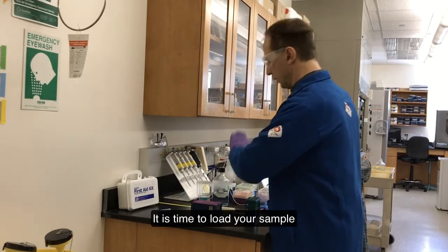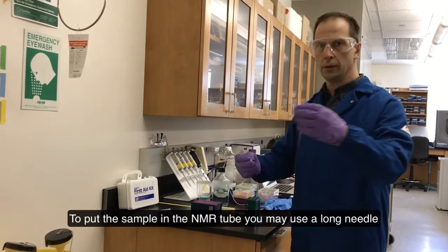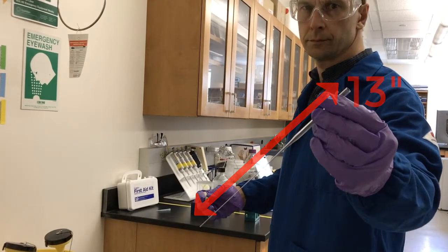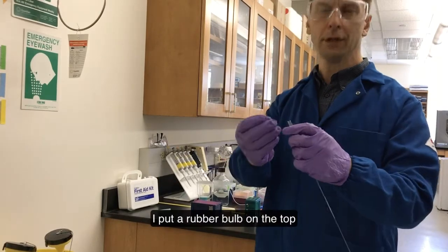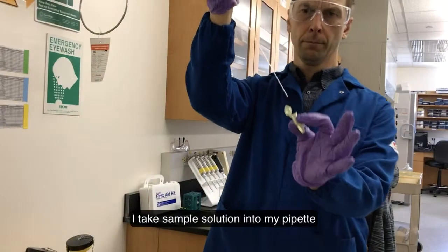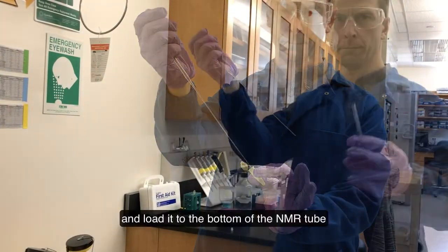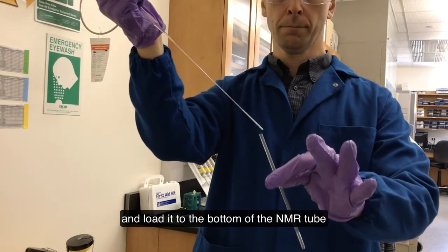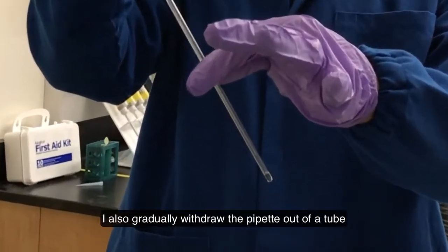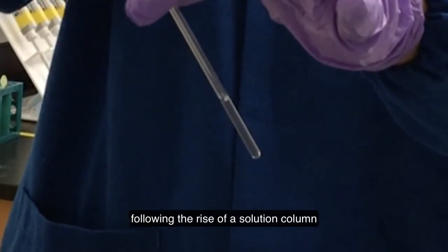It is time to load your sample. To put your sample in the NMR tube, you may use a long needle or a 13 inch long tip pipette. I put a rubber bulb on the top. I take a sample solution into my pipette and load it to the bottom of the NMR tube. As I expel solution from the pipette, I also gradually withdraw the pipette out of the tube following the rise of the solution column.